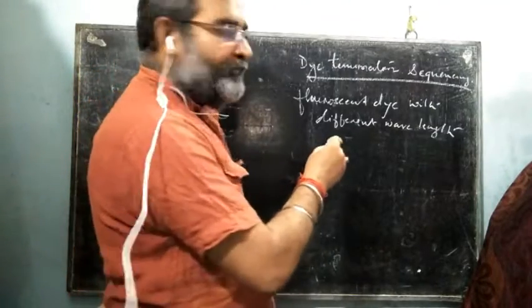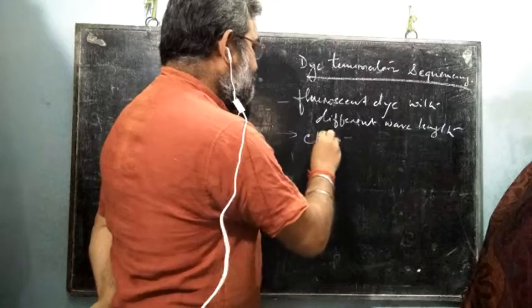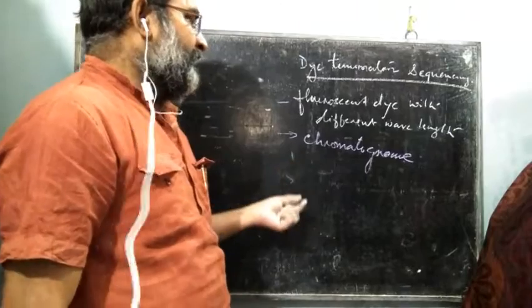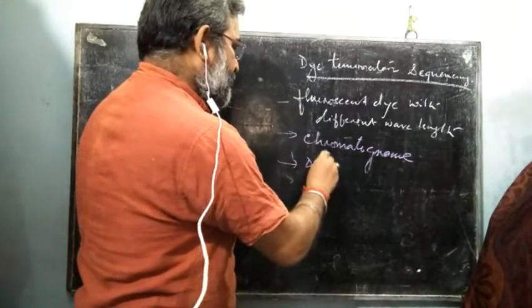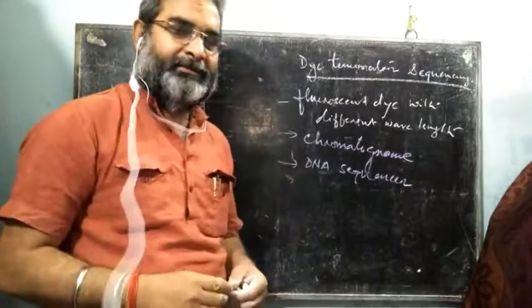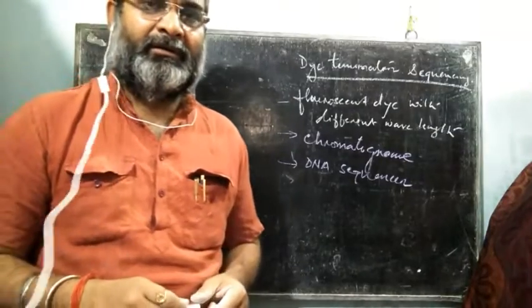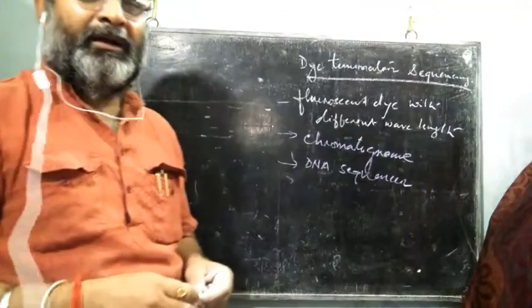we are in a position to analyze exactly the DNA sequence by a chromatogram. Now a machine has been developed, known as the DNA sequencer. We now use an automated machine, the DNA sequencer, which is responsible for the sequencing as well as production of the chromatogram, and the chromatogram is also analyzed by commercially or non-commercially available software.